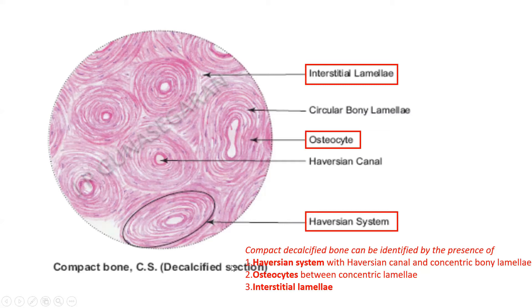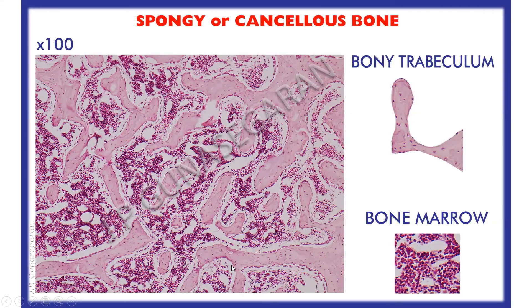This is a spongy or cancellous bone made of irregular bony trabeculae separated by marrow cavity containing bone marrow. These trabeculae are lined externally by endosteum containing osteoblasts and osteoclasts, whereas the osteocytes are embedded in the bony matrix. The structural detail can be identified very clearly in a higher magnified photomicrograph.